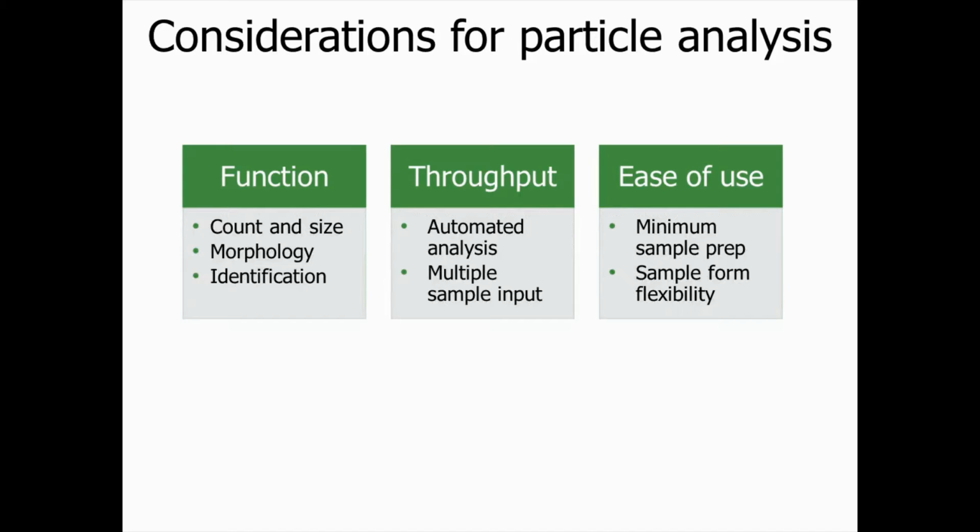The technique should also be easy to use and have minimum impact to particles during sample preparation to prevent introducing unnecessary stress, which can cause further particle size or shape change.